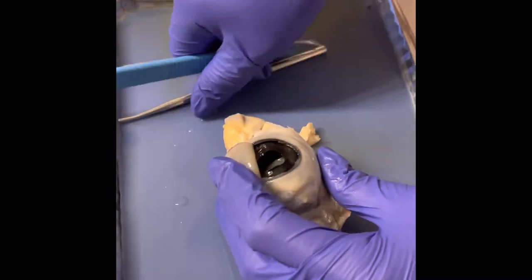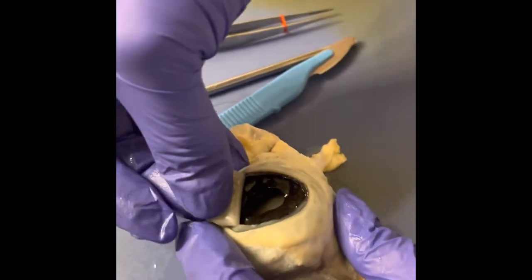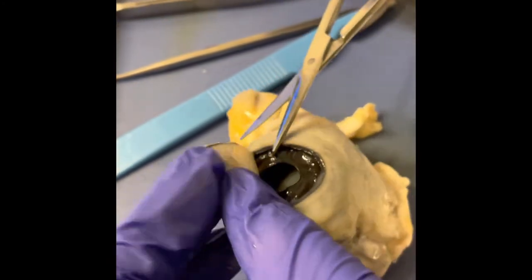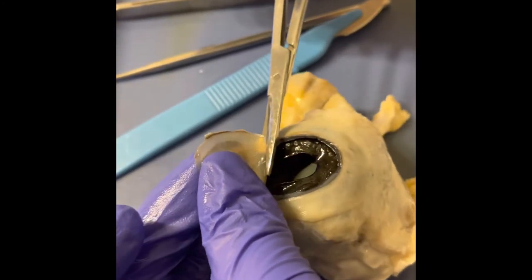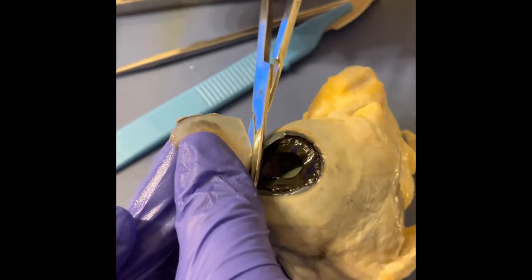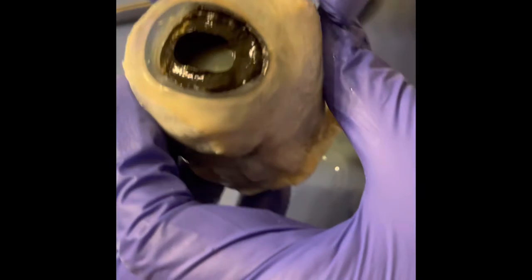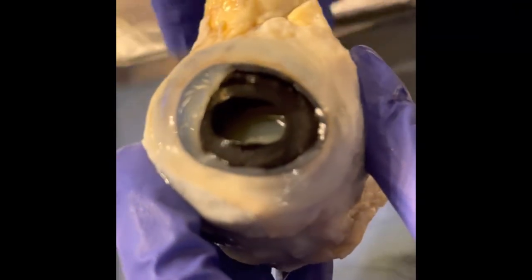The pupil actually signifies a blank space in the eye, almost like a space for the eye within the iris. After dissecting the cow's eye, I noticed the pupil is actually not black, but it is indeed clear, and it appears to be black just because there's no light shining behind it.